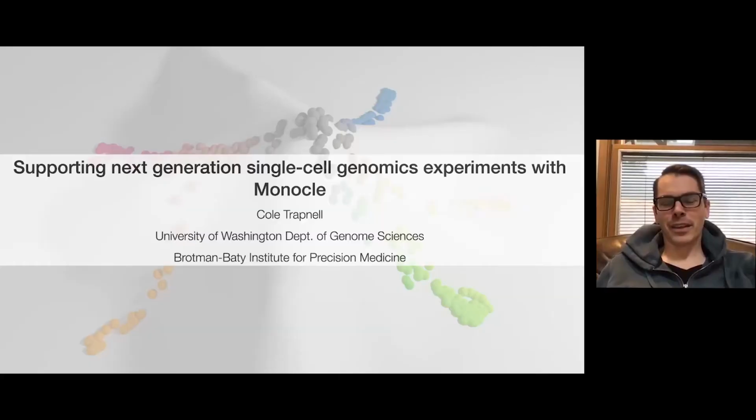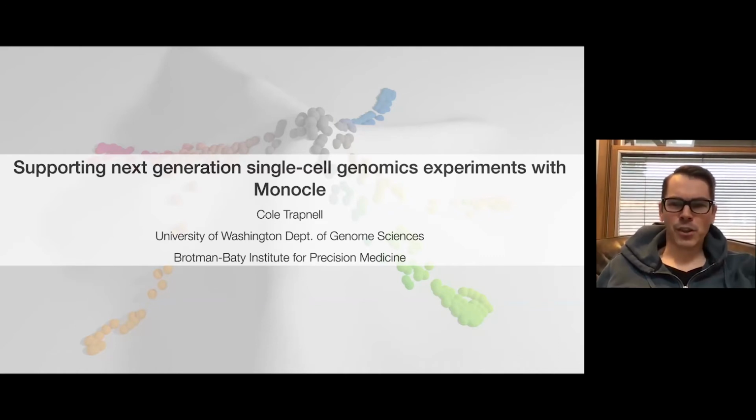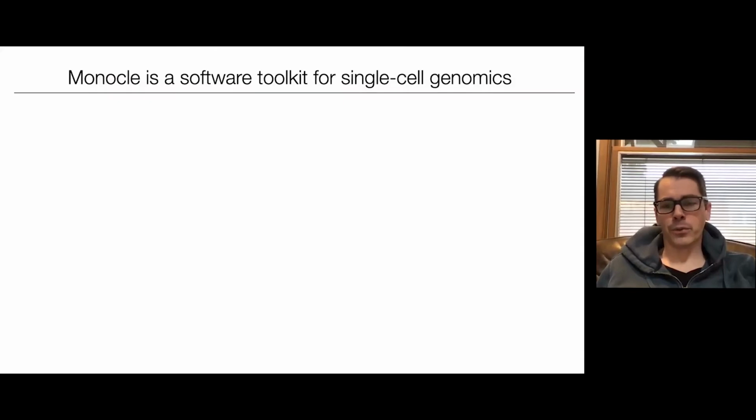Yes. Cool, thanks. So I'm Cole. I'm from Seattle, and I'm going to tell you today about Monocle. But I looked at where I was in the lineup, and so I figured I would probably not need to do a lot of introduction on the types of analyses that folks do with single cell genomics, because there is a lot of overlap between Monocle and both Scanpy and Seurat.